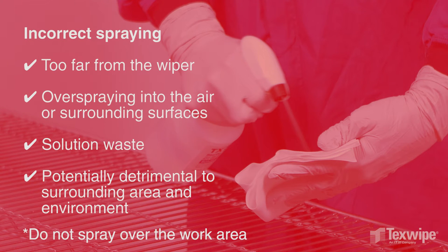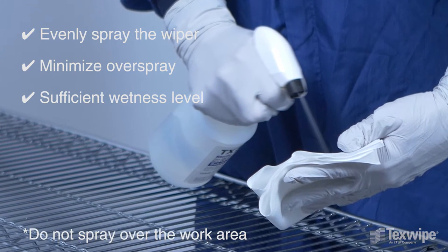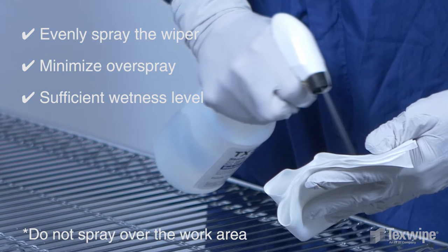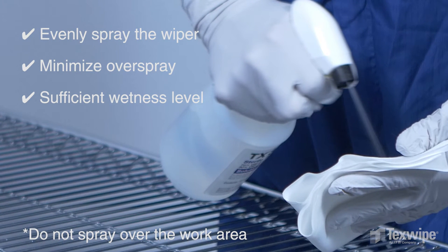Do not wet the wiper over your work area. Evenly spray the wiper by holding the nozzle at a distance that does not create overspray, and minimize overspraying into the air or surrounding surfaces. The wiper should have a sufficient wetness level to leave a thin, visible layer of solution on the surface.